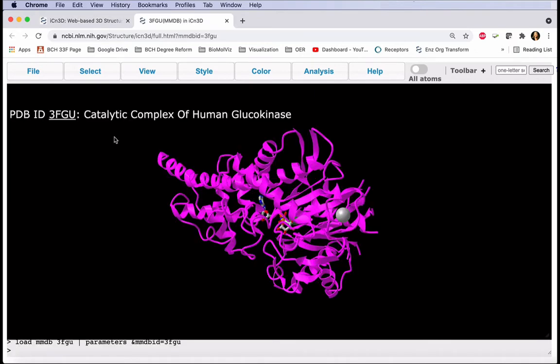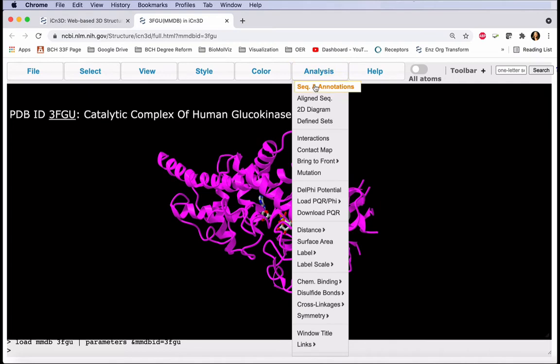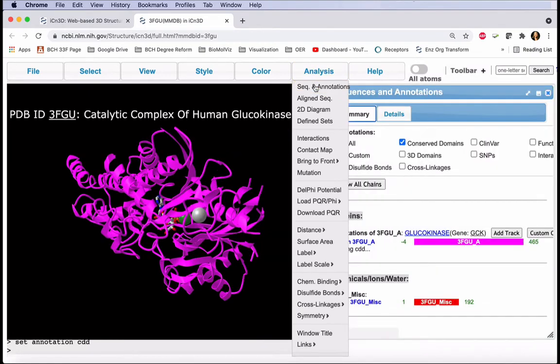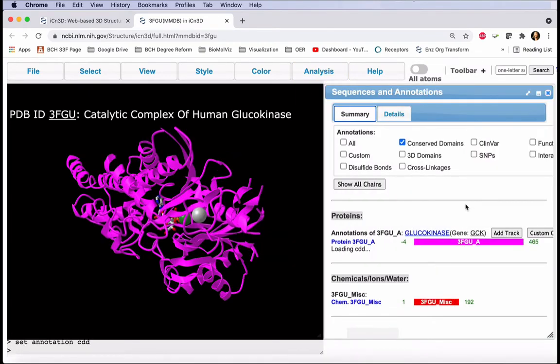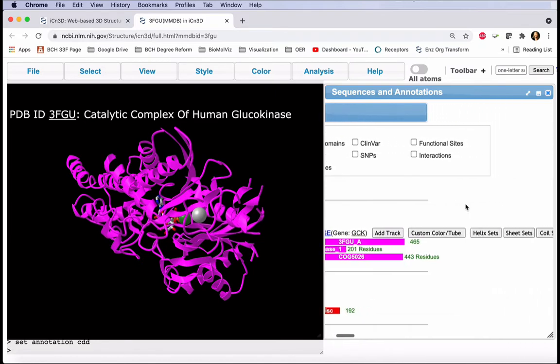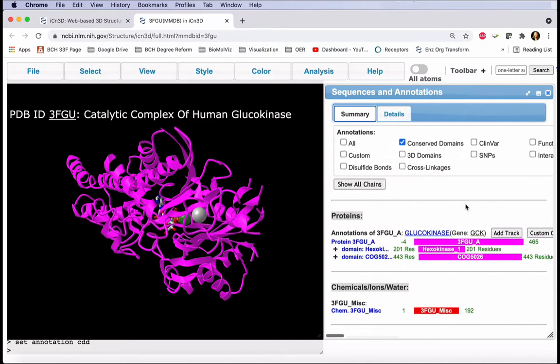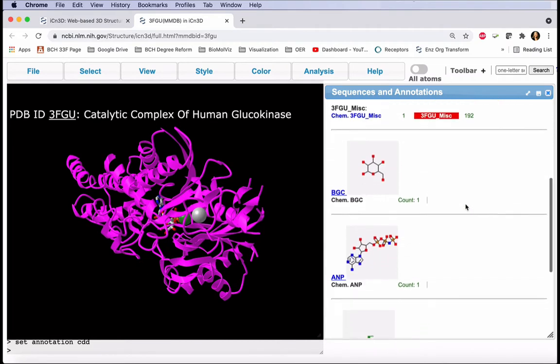To identify our ligands, we can use the analysis menu, sequence and annotations. Clicking here gives us this pop-up window. Note that you may need to scroll left and right, depending on your screen resolution, and up and down.